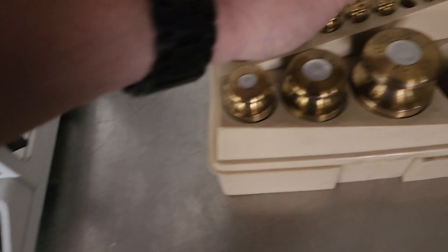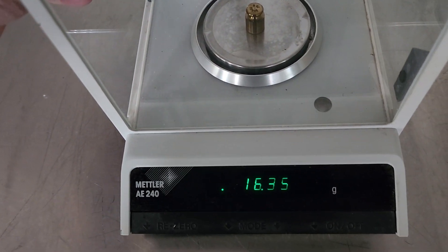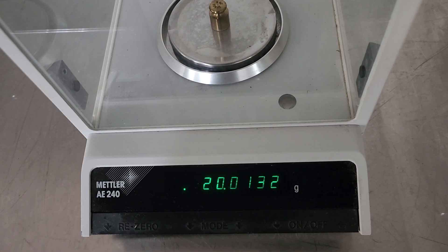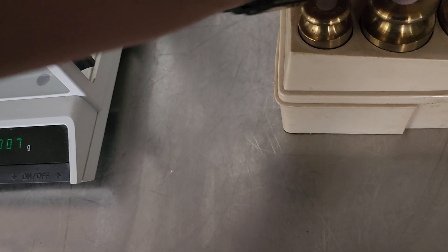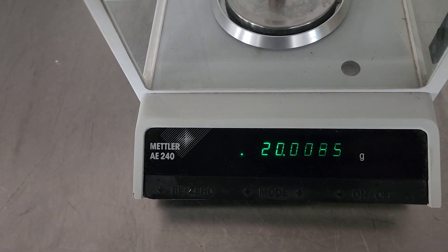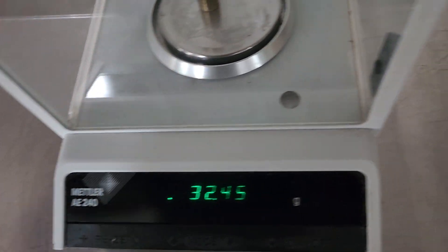Pull that one off. We'll grab the next one. There's a 20.